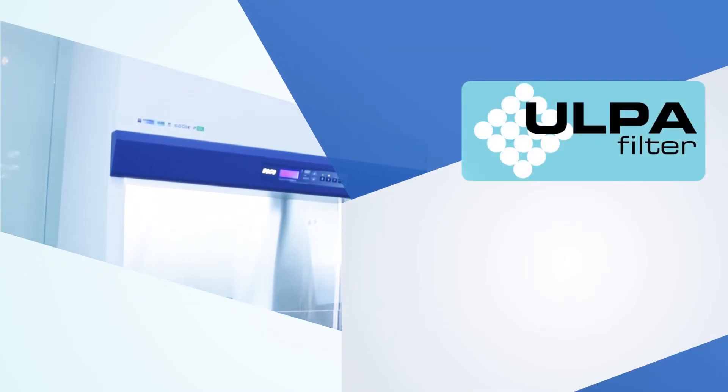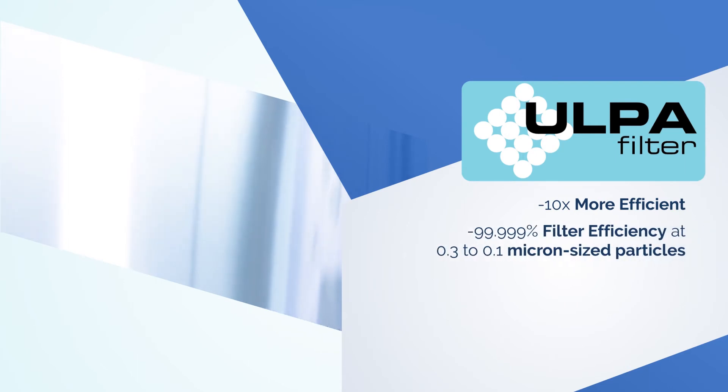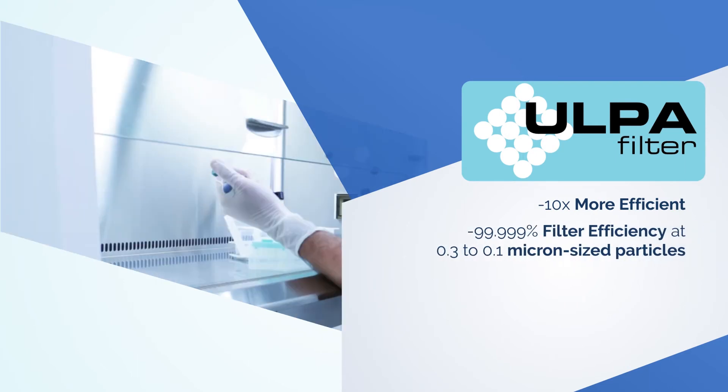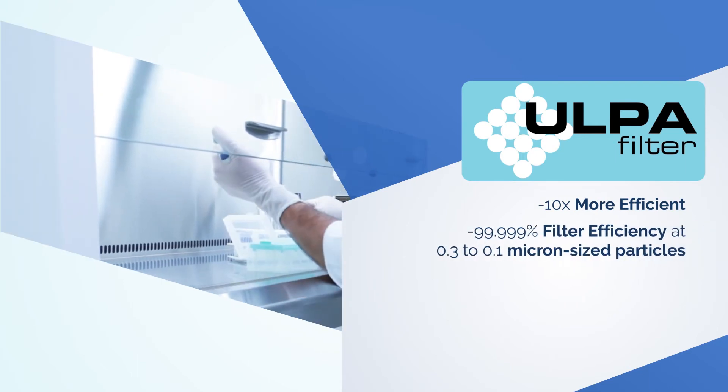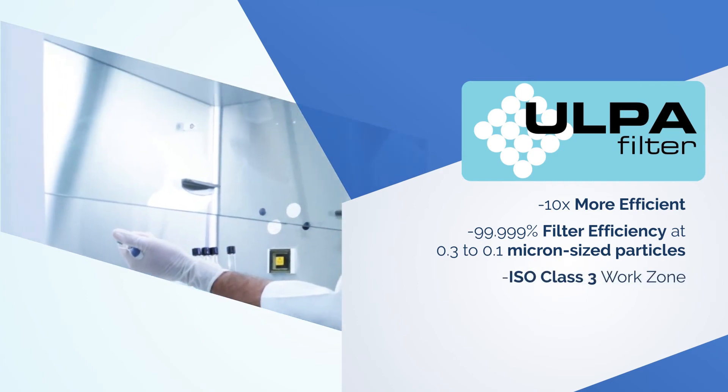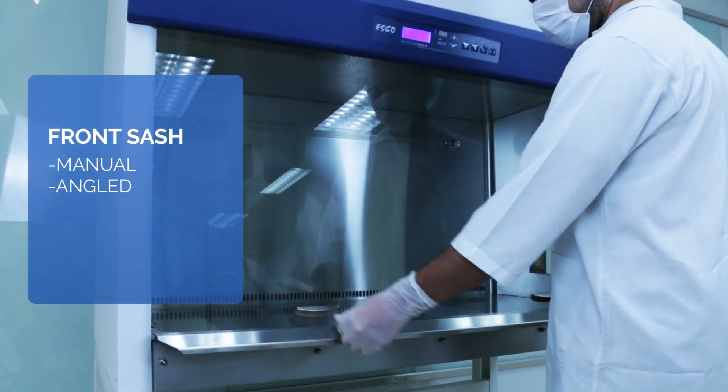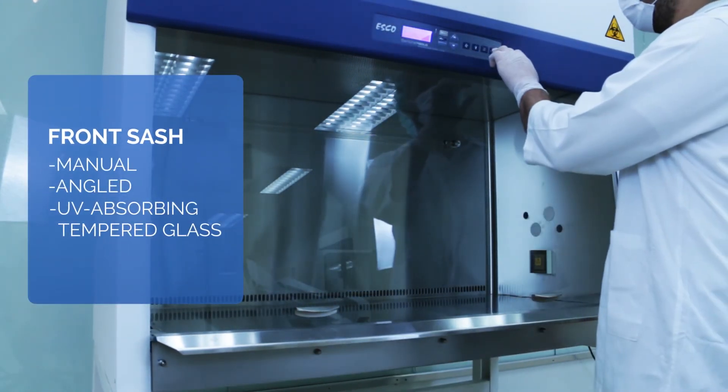Esco Biosafety Cabinet uses ULPA filtration system having 10 times more filter efficiency of 99.999% at 0.3 to 0.1 micron sized particles versus HEPA filter. It's manual angled UV absorbing tempered glass front sash that can be operated even during power failure.